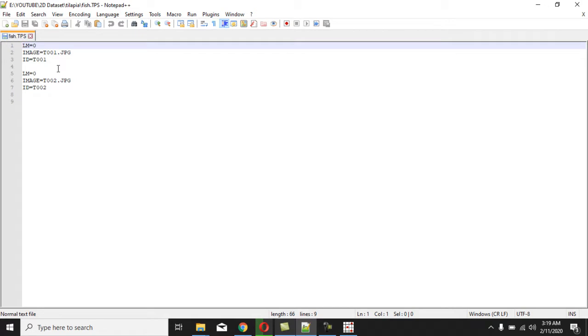All right. So what I'm going to do now, we are not going to be using this anymore, because let's assume you have 500 images you want to digitize. How will you do this? You may have different kinds of names that you call your images. You would have to do this one by one. This will be too hectic and laborious.